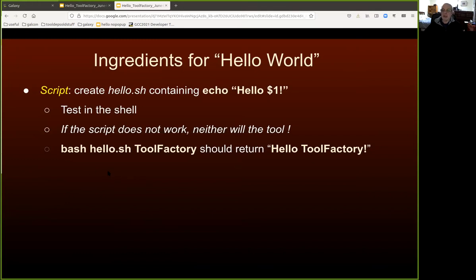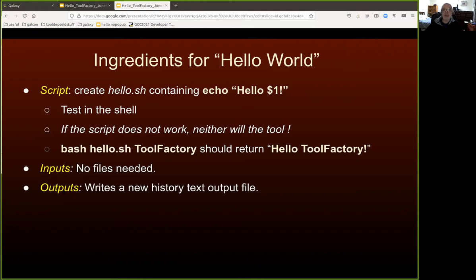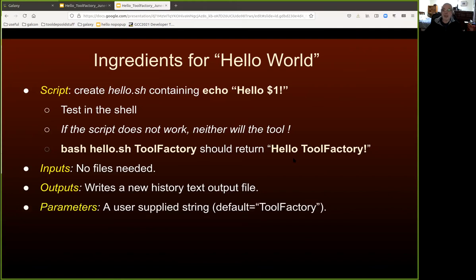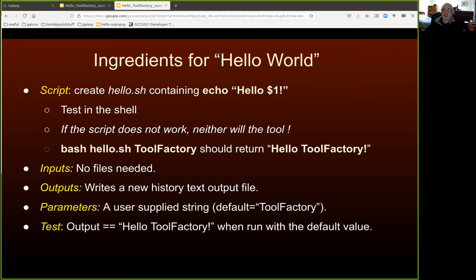Given a working script, what inputs do we need for Hello World? We don't need any files from the user's history. We do need an output — a new text file containing the emitted string. We need one parameter: the user-supplied string that follows the word Hello in the output. Finally, we need to build a test, and the logic should be that the output from the tool, when run with the default value, should be exactly the string 'Hello tool factory'.